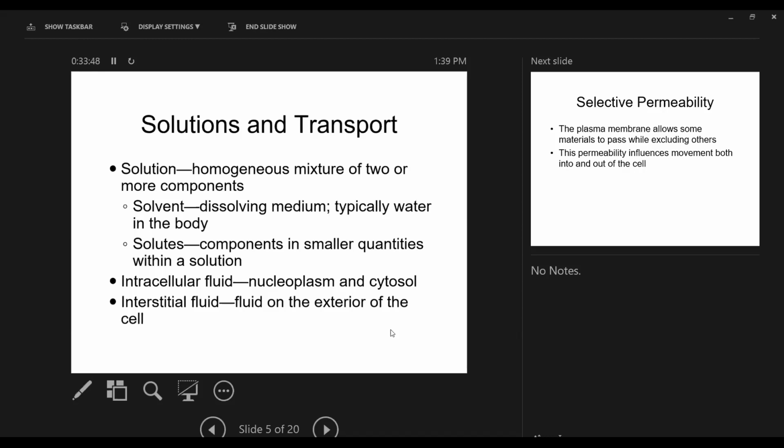And now you have a salt water solution. It is clear, it is transparent, it is what we say homogeneous. You can't see the water and the salt separately. The water and salt don't appear separately. You only see the water. You see what's known as a transparent solution: a solvent and a solute.